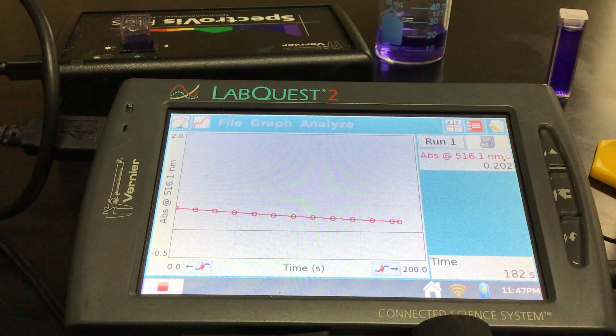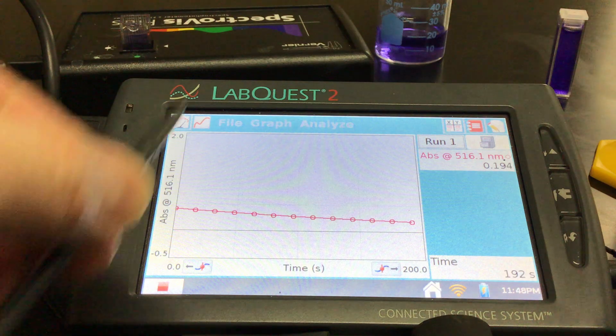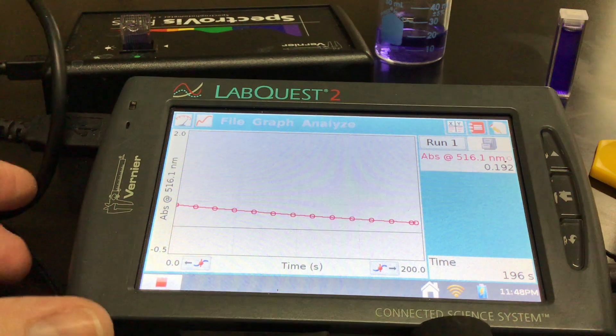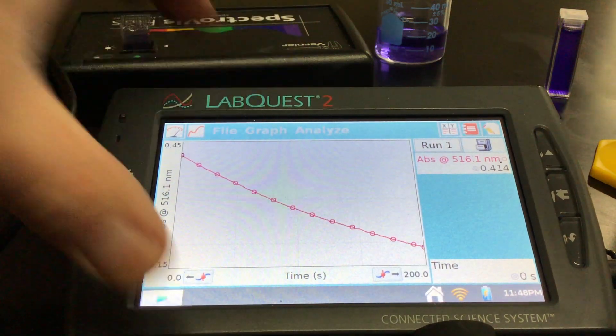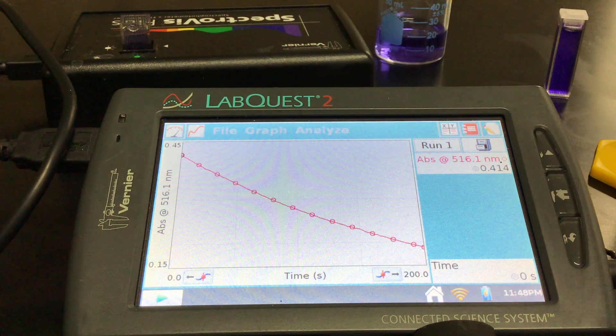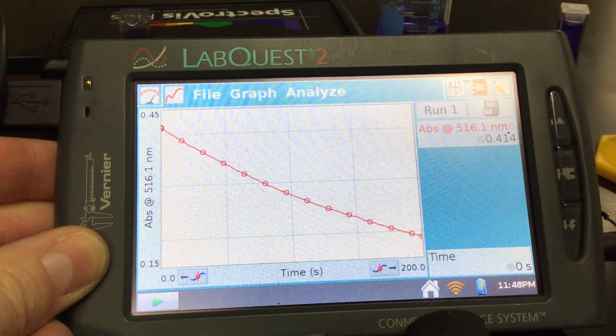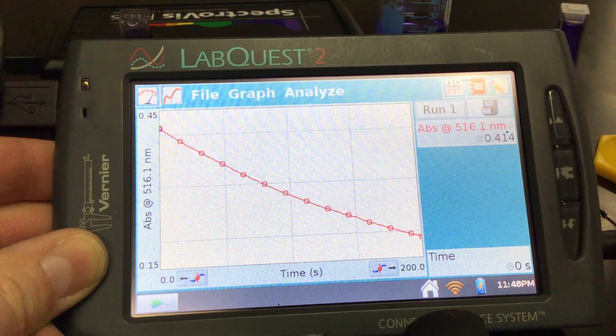One nice thing about the LabQuest is that after this they generally auto scale to fit the screen. If they don't, you can go under graph, graph options and change it. It's a little hard to see with the angle of the LabQuest, but there we go. So to my eye it doesn't look like this is a linear relationship.